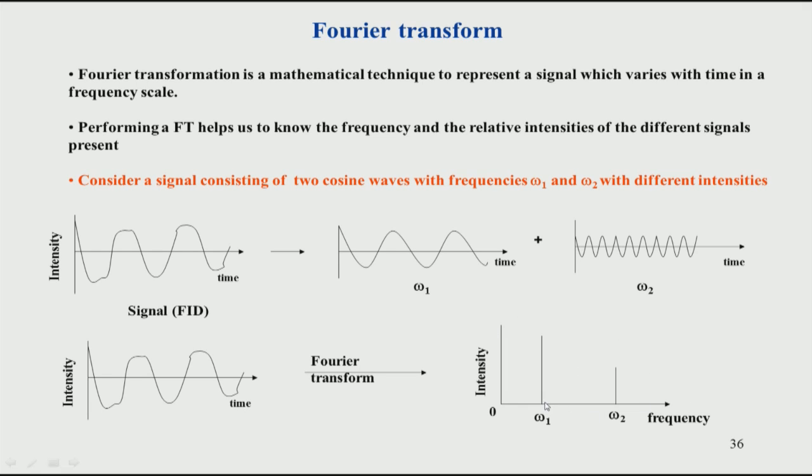If you see here now, the intensity of this peak is directly proportional to the number of hydrogens here. In the case of methanol, we discussed that there are 3 hydrogens. So, this signal will be 3 times stronger compared to this. Of course, in this picture it does not look like so, but qualitatively you can think of it that this particular thing is 3 times this, depending on the number of hydrogens. So, if you have 4 or 5 or n number of hydrogens, this signal will directly be related to the number of hydrogens, whereas this is also similar.